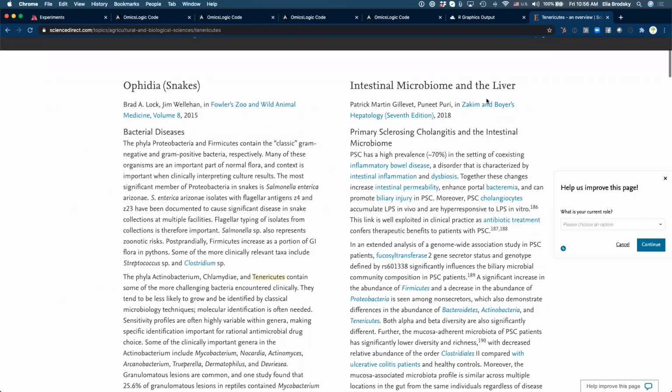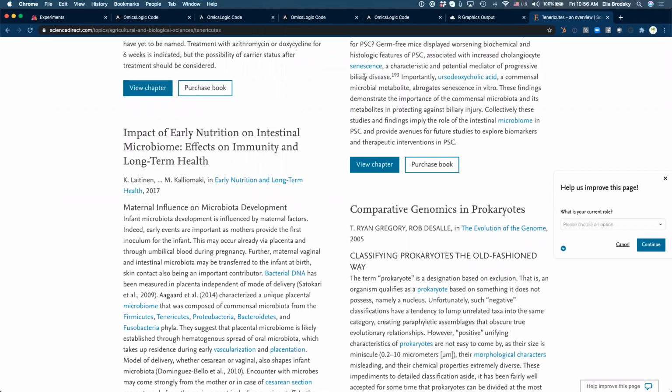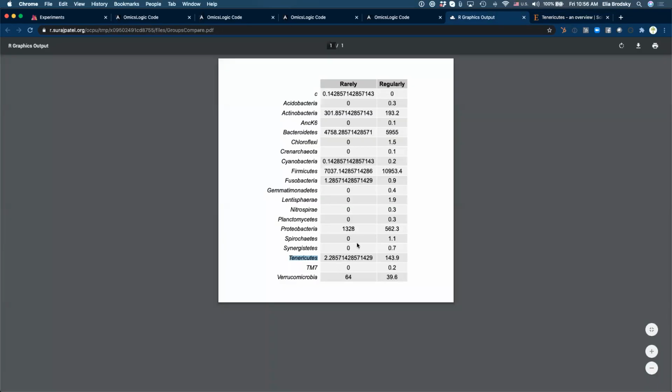Again, intestinal microbiome in the liver. So we can now study specific representatives that we think are more informative, right? So here I can see almost twice as much proteobacteria than here, right?